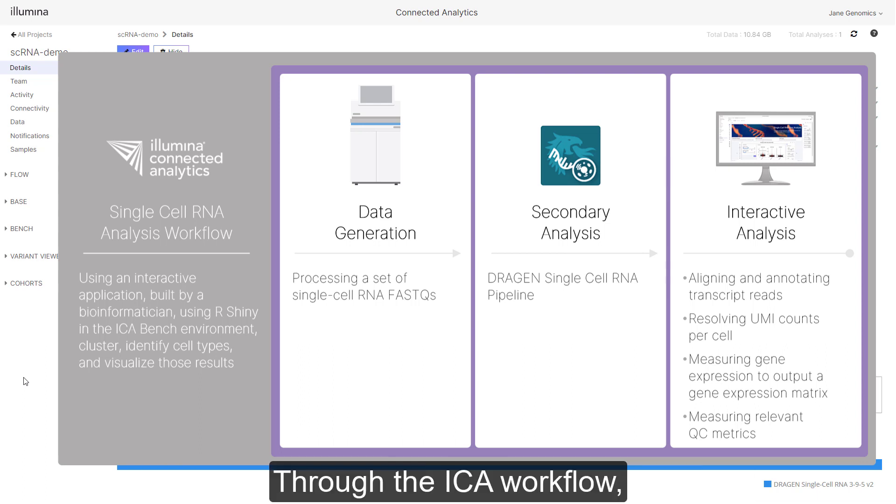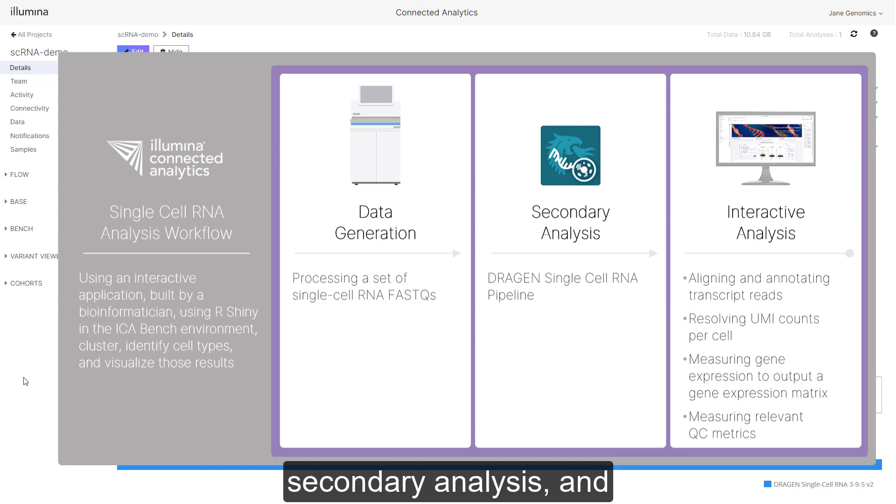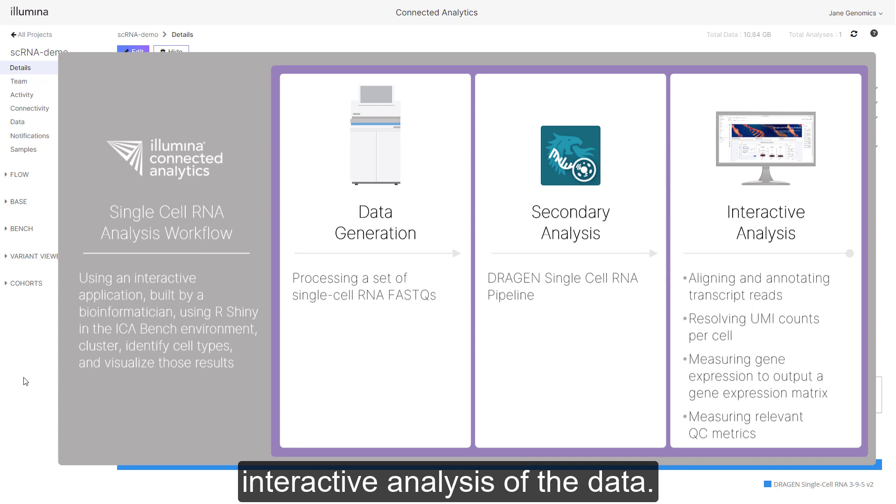Through the ICA workflow highlighted are the data generation, secondary analysis, and interactive analysis of the data.